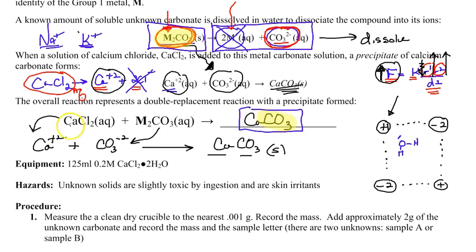So when we precipitate out all of the carbonate ions, what we're really doing is taking a piece of information along with the original salt. What's that piece of information? Every one of our metal carbonates has 1 carbonate. So if every one of these carbonates came from an original dissociation of the metal carbonate, we have a piece of information locked in our precipitate.